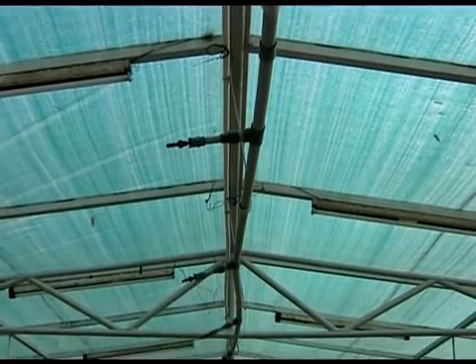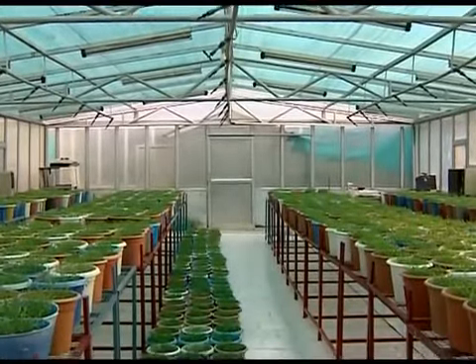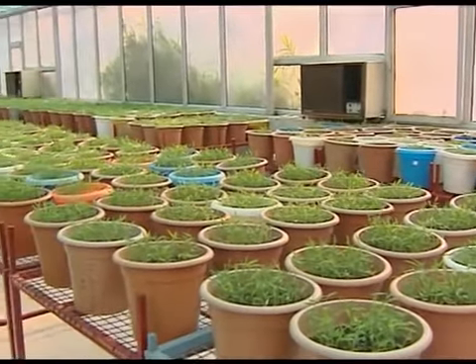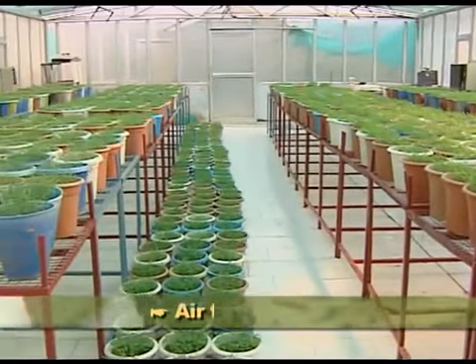Now the tissue culture raised plantlets, TCPs, are transferred to greenhouse or outdoor conditions, and they are subjected to different types of shocks like temperature, humidity, nutrition, carbon dioxide, and airflow shock.